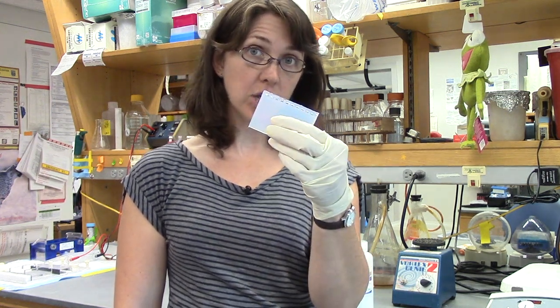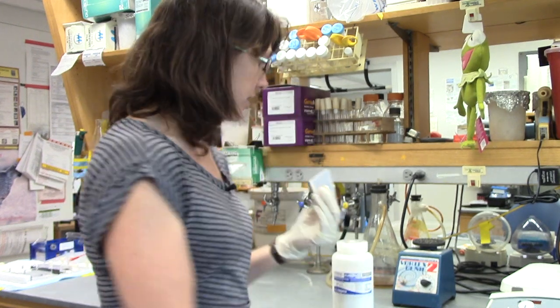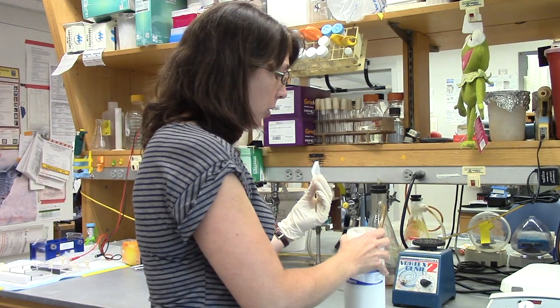Of course, DNA is tiny. You can't use hardware cloth to separate pieces of DNA. You need something a lot smaller. So what we use is a gel. That's where the gel from gel electrophoresis comes from. This is a gel. And you make it from this powder. It's just a white powder. It's a carbohydrate that's isolated from an algae. You mix it with water, heat it up in the microwave, let it cool. It's basically like jello.